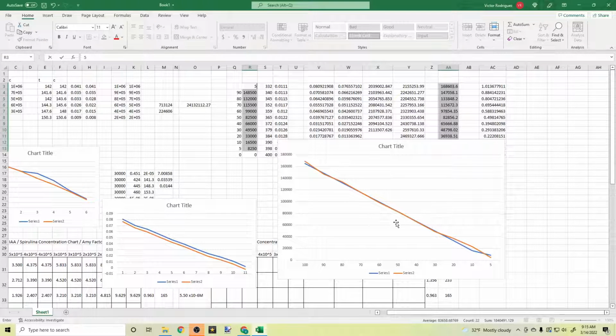This is the graph that I was able to come up with, the calibration curve, even though it's not really a curve. I believe the blue line is the expected, and the orange line is the actual amount. Now I didn't scale it properly, so that's why you see a little hiccup towards the end, because it goes from 20%, 10% to 5%, when really it should be scaled down a little bit because the interval isn't the same. So it looks a little stretched out.